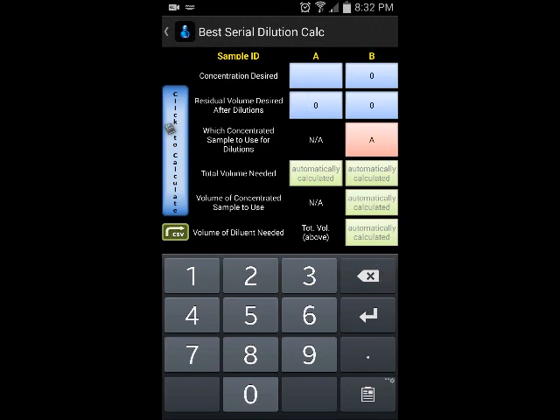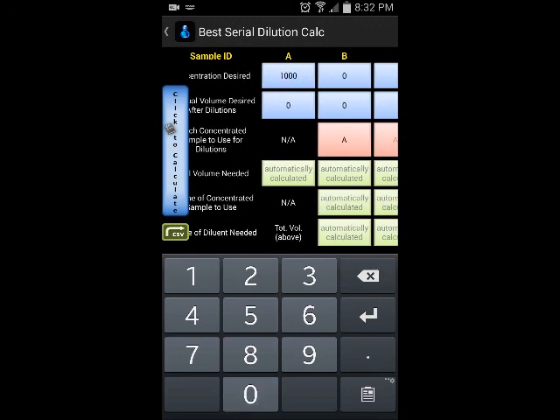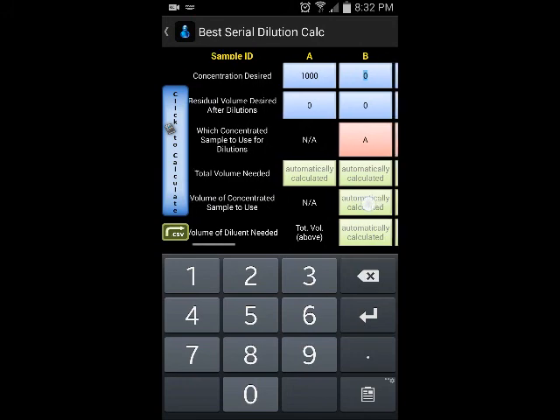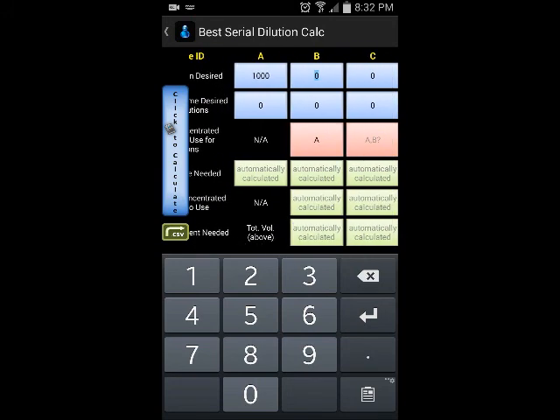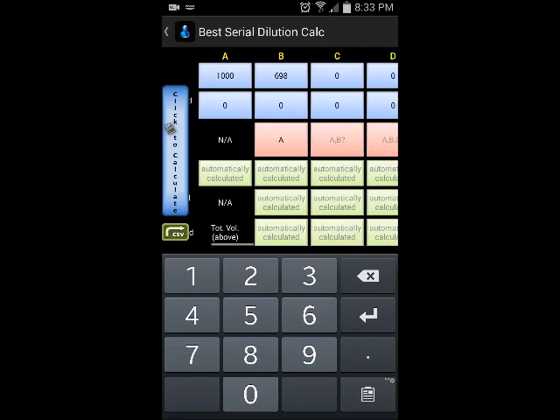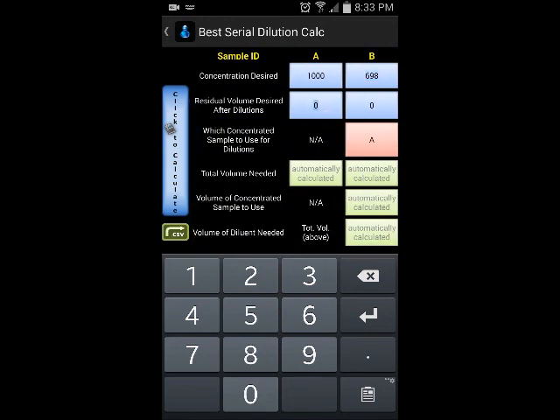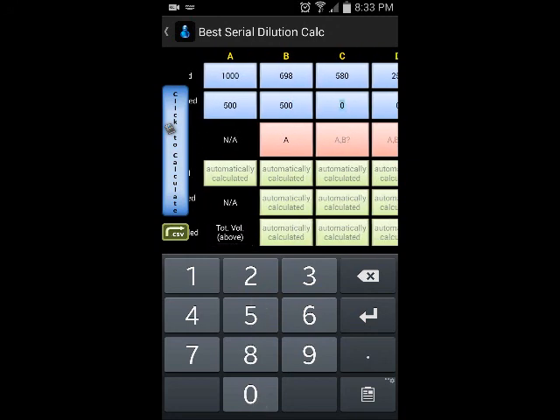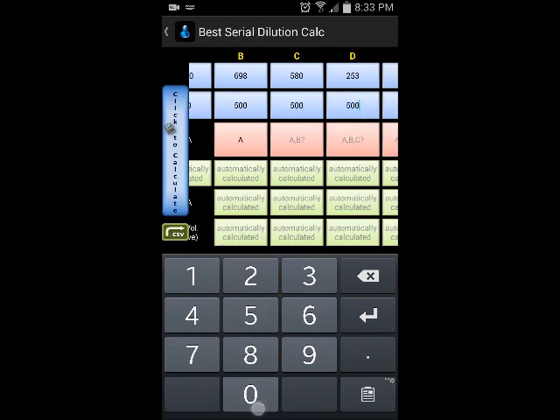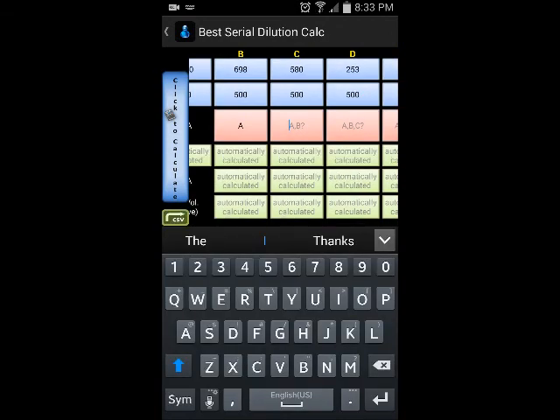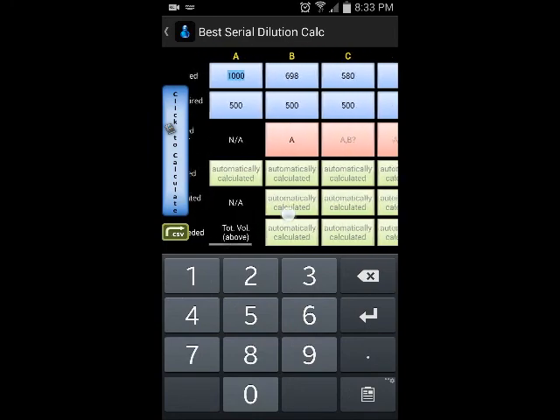If you've never used this program, let me show you how it works. Start off with your highest concentration, then go lower — that's the definition of serial dilution: using higher concentrations to make lower concentrations. You can do very irregular serial dilutions and pick any number you want as long as it's lower than the previous one. What I love about this is you pick the residual volume you need after making the dilutions. So if I'm treating cells with 450 to 500 microliters, I need at least that much volume remaining. You enter that and all the work is done by the program.